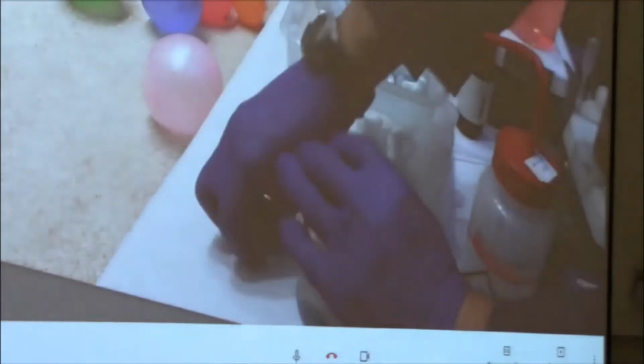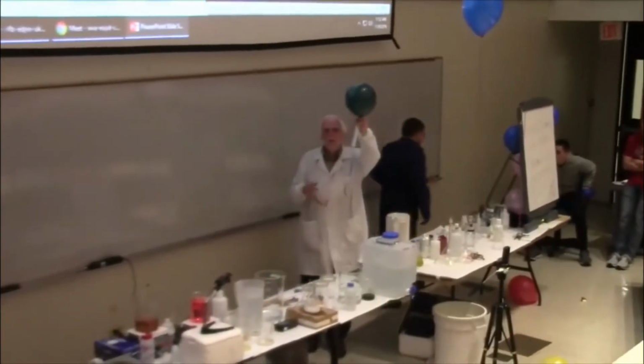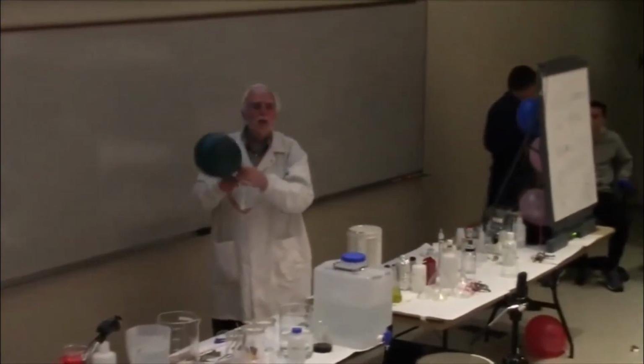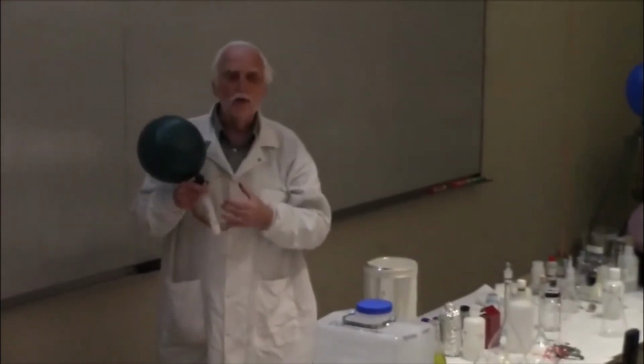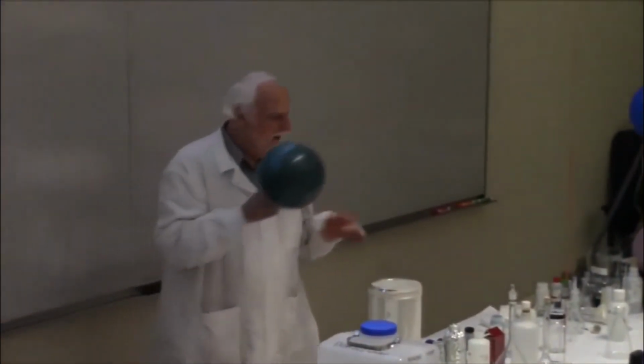Alright, so I can continue, and I can put the entire box in this little bowl. Anybody have an idea? No, I'm not going to take it. I need something colder than dry ice, which would be what? And then here I have liquid nitrogen.